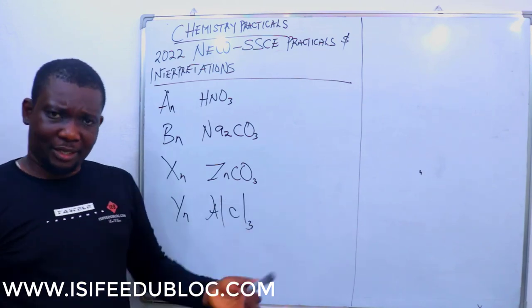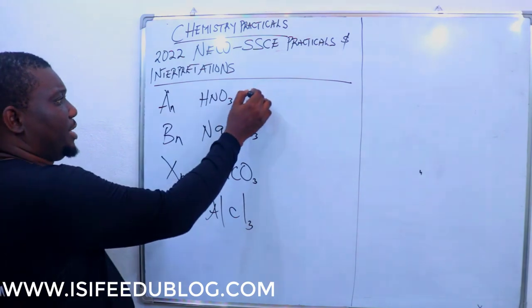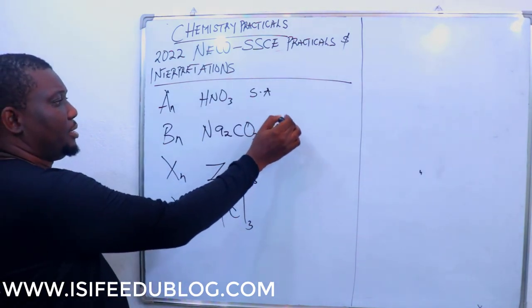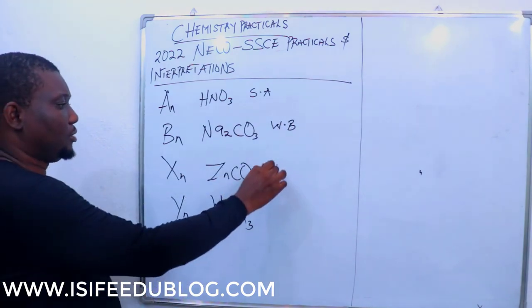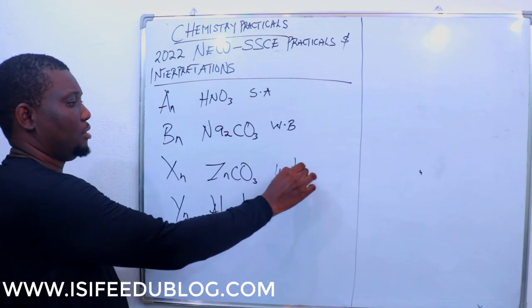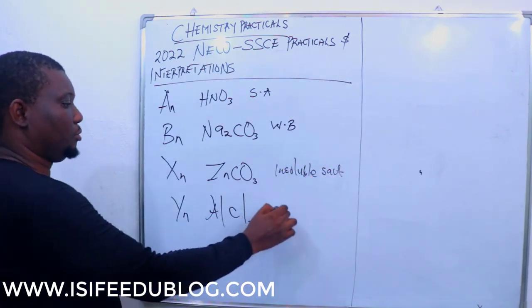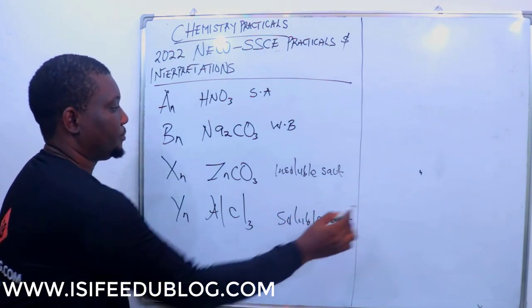The analysis now continues. Of course, you should know this is a strong acid. This is a weak base. This is an insoluble salt. And this is a soluble salt.